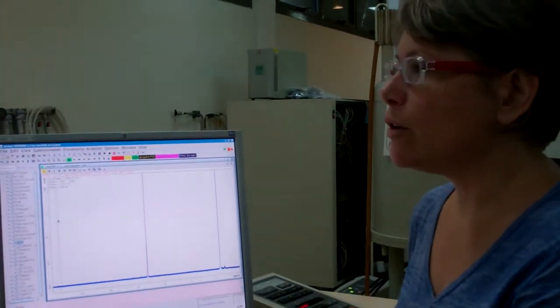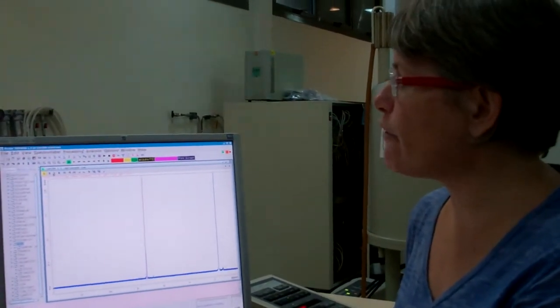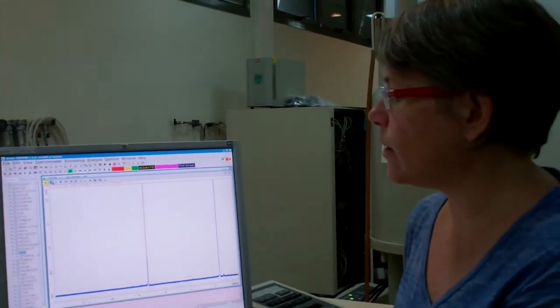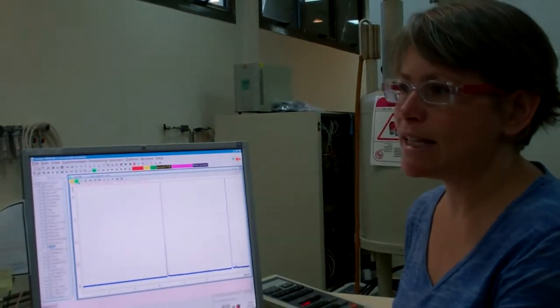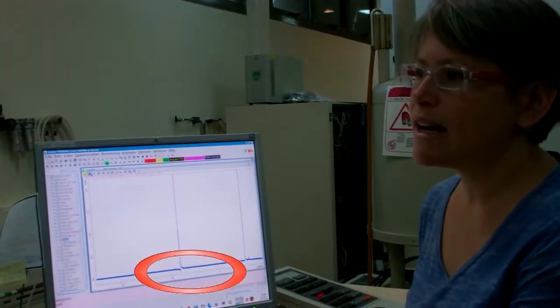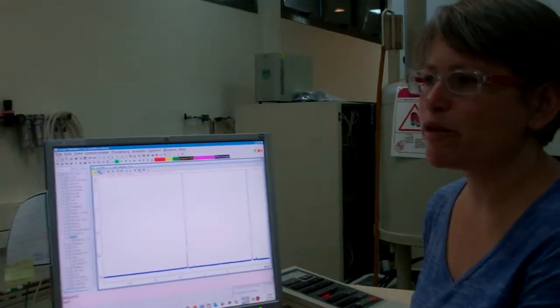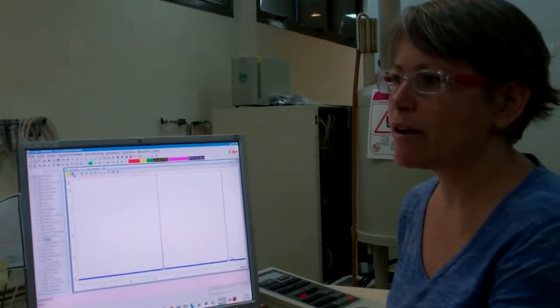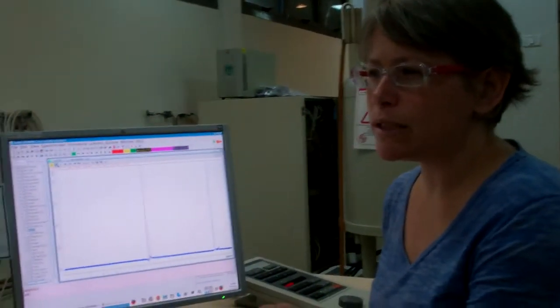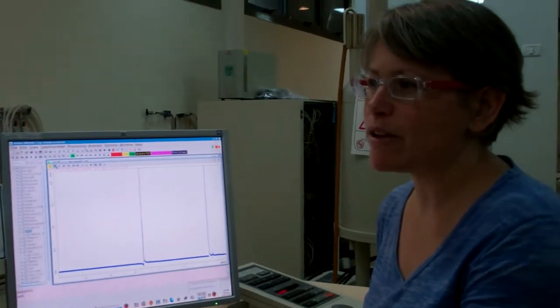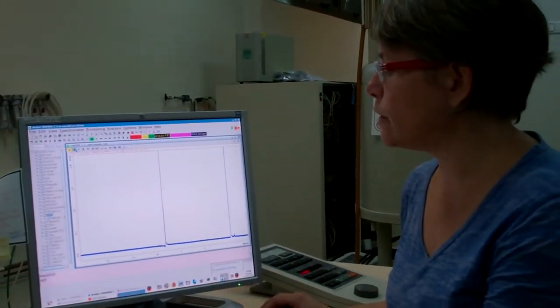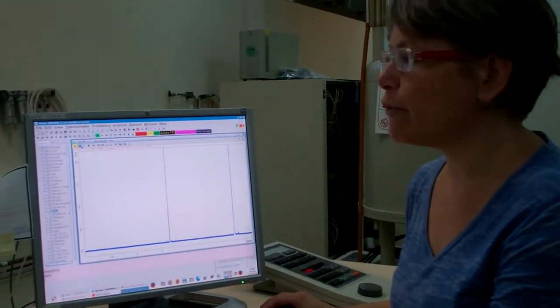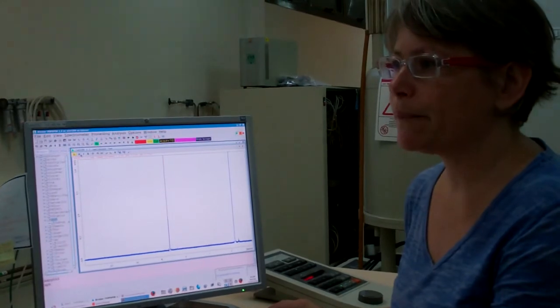I will click and hold down the left mouse button on zero, and you can see the effect as I move the mouse forward and back while still holding down the left mouse button.